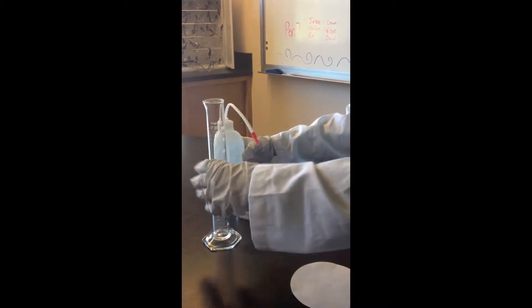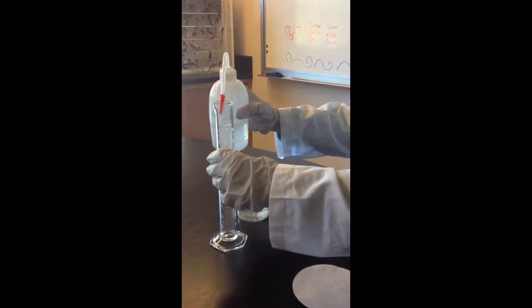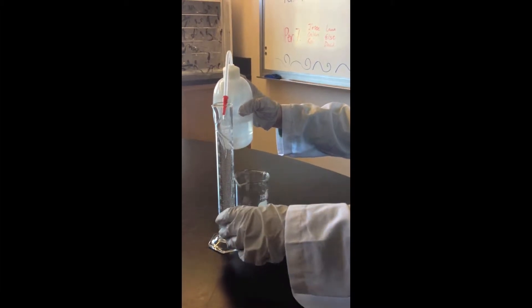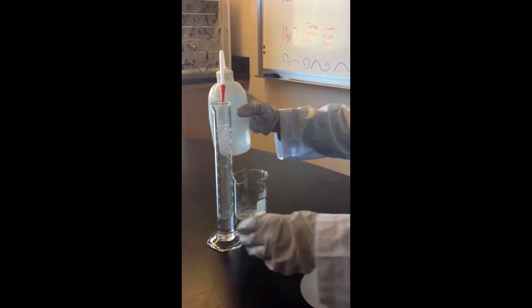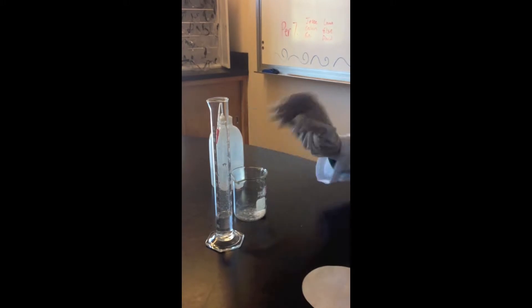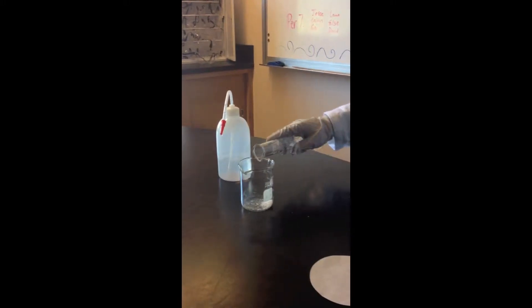Pour 20 ml of water into the graduated cylinder. Then pour the water into the beaker with the Silver Nitrate.